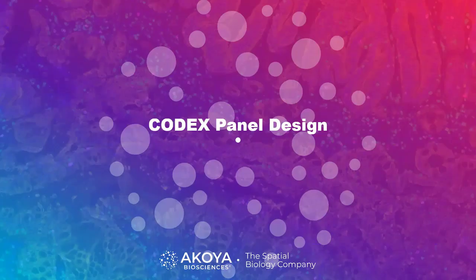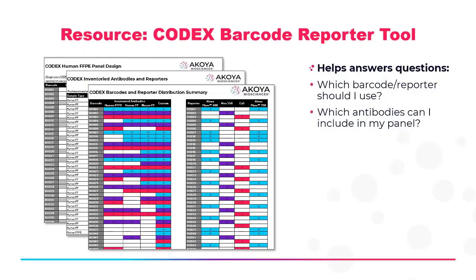This next section of the talk will cover CODEX panel design. We have a number of tools available to aid in designing your own antibody panels. This antibody panel design tool is available upon request, and it can help you answer such questions as which barcode and reporter should I use for my custom conjugation, and which antibodies can I include in my panel. In the next few slides, I'm going to break down each tab of this design tool.